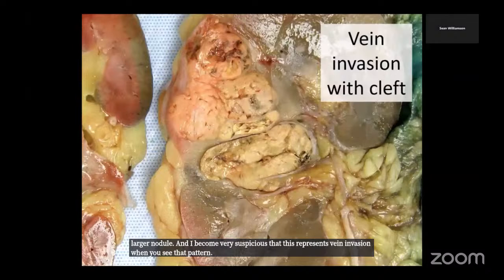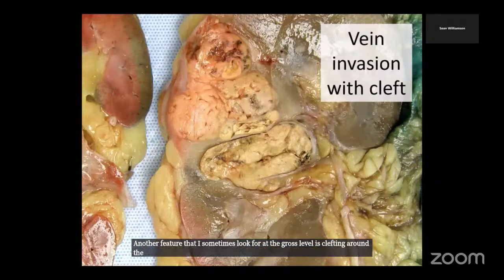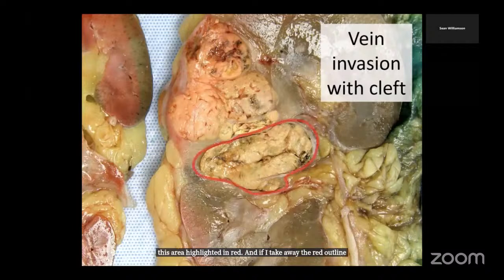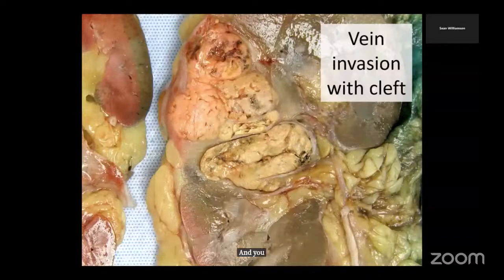Another feature that I sometimes look for at the gross level is a clefting around the areas that maybe represent vascular invasion. So here we have this area highlighted in red, and if I take away the red outline, you could sort of see that there's a cleft around that area. Also, if you flex the specimen, that might accentuate the cleft, and you can further support your impression that that's within a vein.